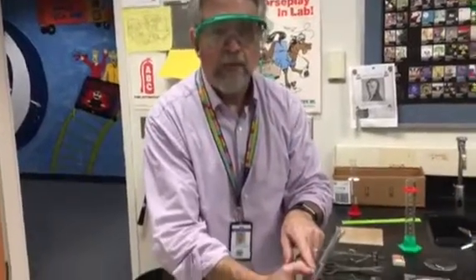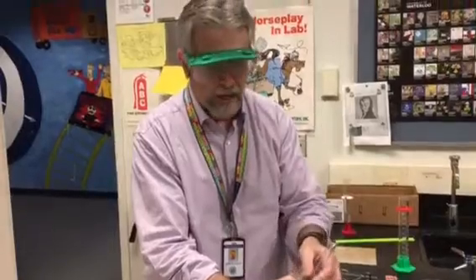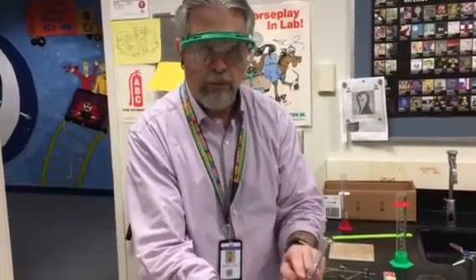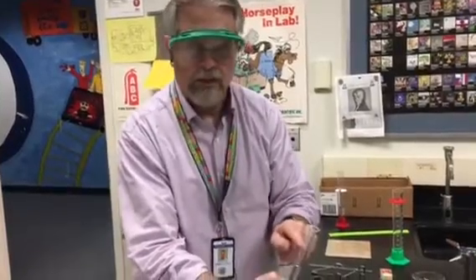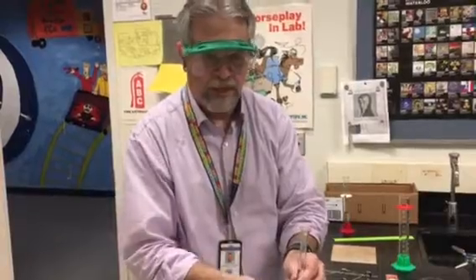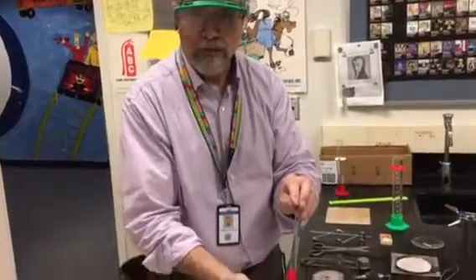So this would be 5.00 milliliters, and that's reiterating what Mr. Soboleski said. So I determine how many places I can get after the decimal, and then when I do my reading, I make sure that anything on here, including if it's right on that line, goes out to that same number of places. And again, 10 milliliter graduated cylinder, 2 places after the decimal.